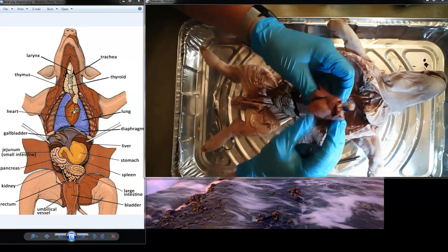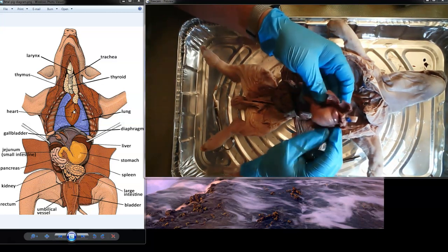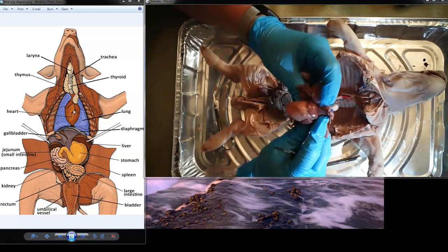All right. Heart. Yes. Question. I took my glove off, and is that the kidney? No, it's not the kidney, it's the heart. So I see the kidney is here. Kidney is like somewhere around here. Here we have the heart.